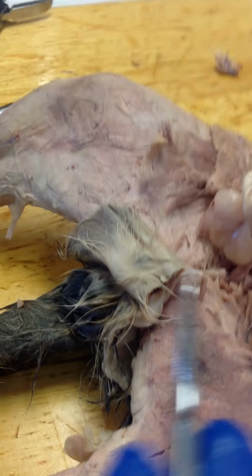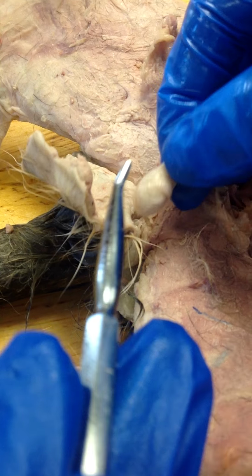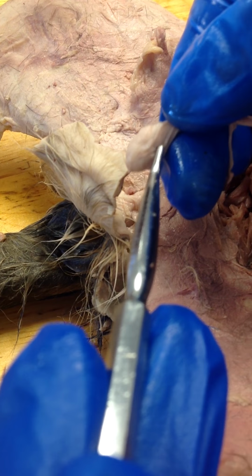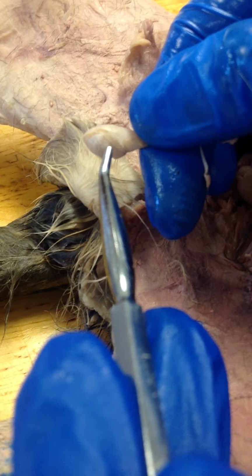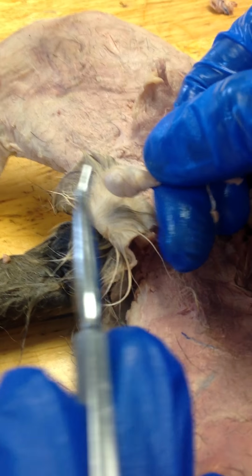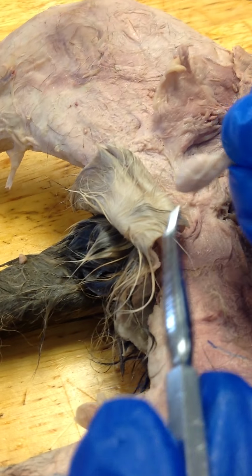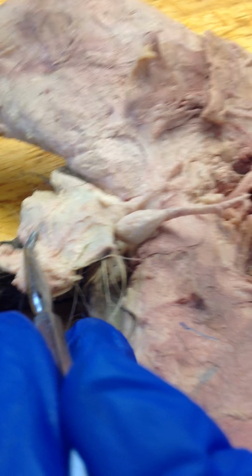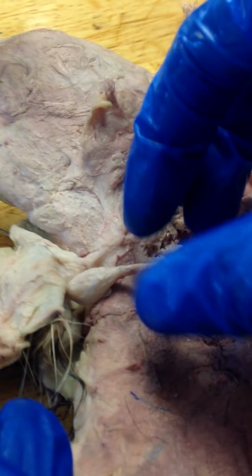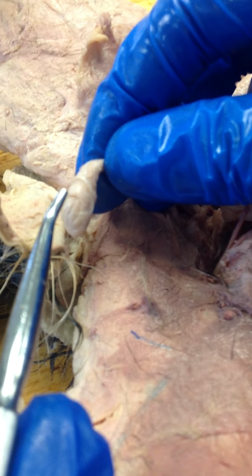We've pulled that back. Tunica vaginalis was the sack that this thing was in. You can still see portions of it. It's a very thin layer. That little bit sticking up is part of it. It's called tunica vaginalis, and as a tip for how to remember it, it's vaginalis, like vagina. All right, next is the epididymis. If you look carefully and focus, you can see it.